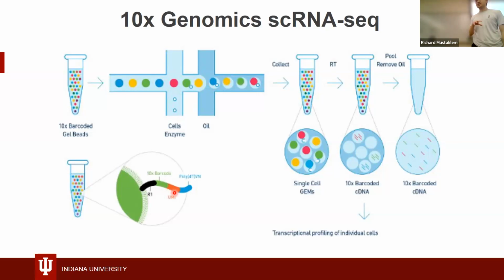But all of this is called the library. So when somebody asks how big is your library, or how was your library prep, this is what they're talking about. They want to know, was it clean? Were there any issues? When they say my library prep was good, they're referring to this process. This is basically just called library prep, which I'm going to display in the next area.